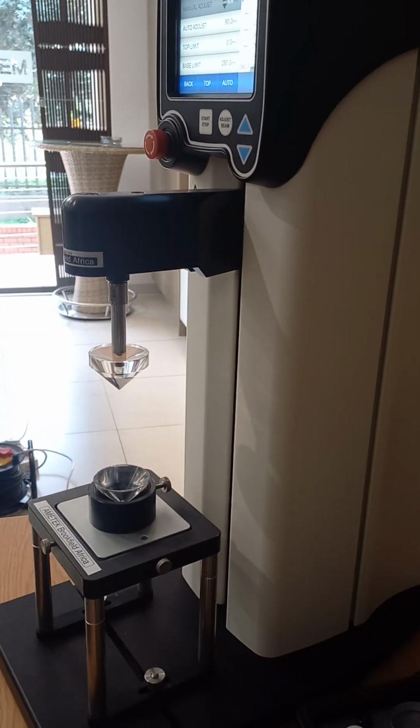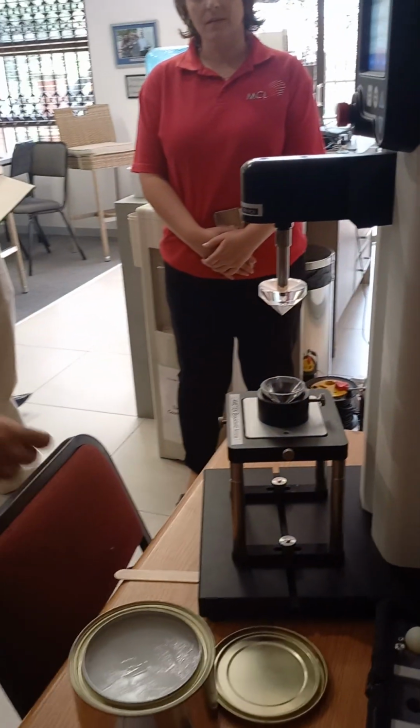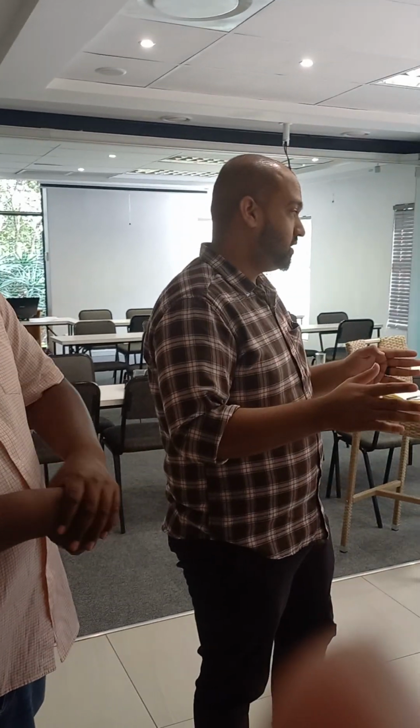If you recall from Elmin's presentation, with thicker and non-flowing liquids, it's a bit more difficult to measure viscosity. And obviously, when you're doing QC, your tolerances are a lot wider as well, because it just doesn't flow, right?